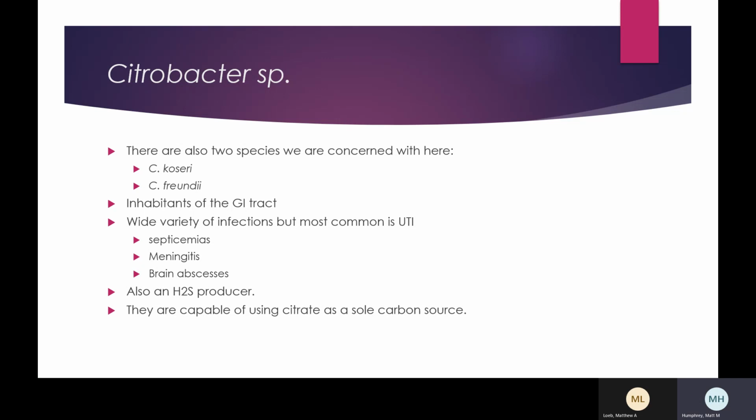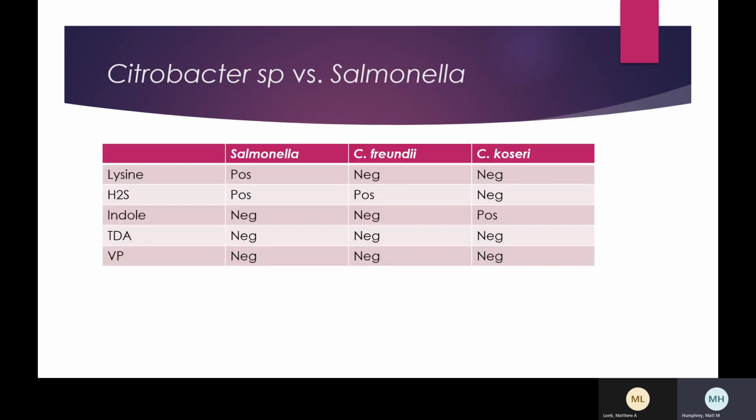And hopefully I have one of those on a plate. You guys can see what I mean. It literally smells like poop. So far we've talked about. I think I can believe you on that. Yeah, that's okay. No, you guys have to suffer too. Okay?